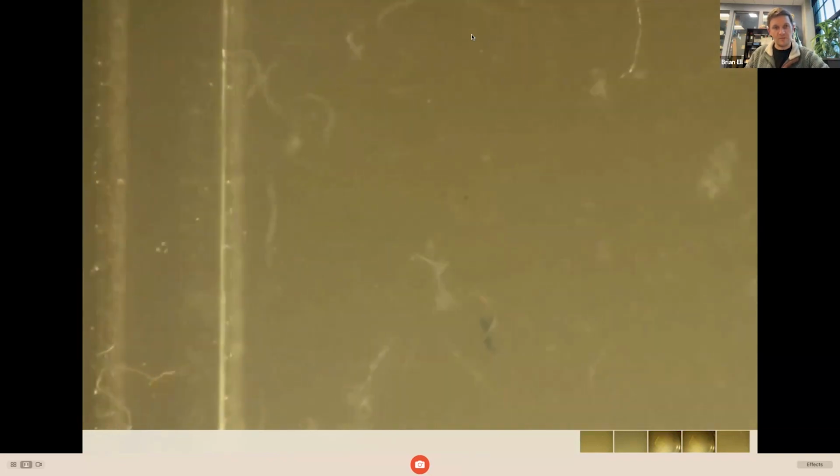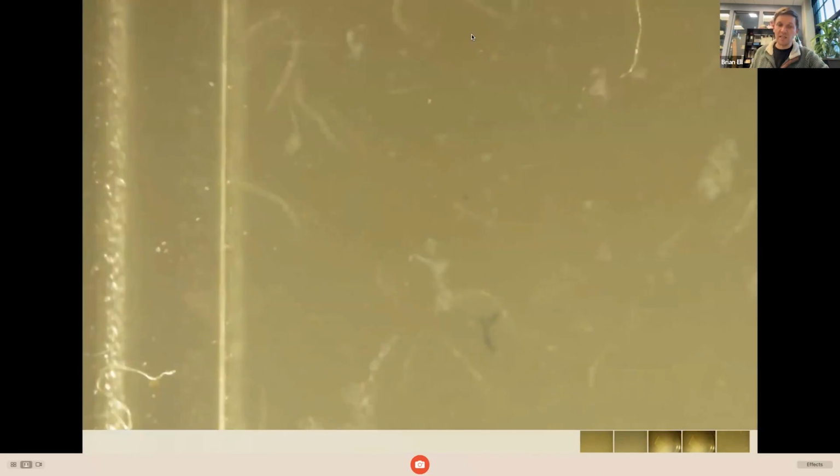So these look pretty good. We'll count for 30 seconds. We wait 2 minutes, and then we do a replicate again, wait 2 minutes, and do it one last time.